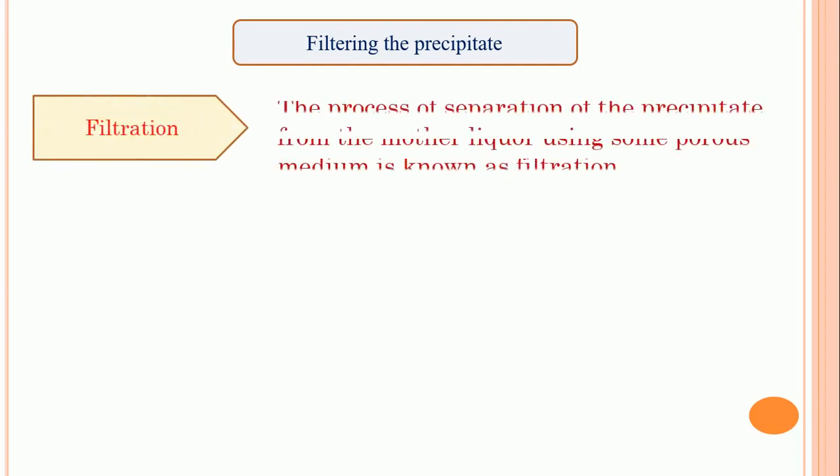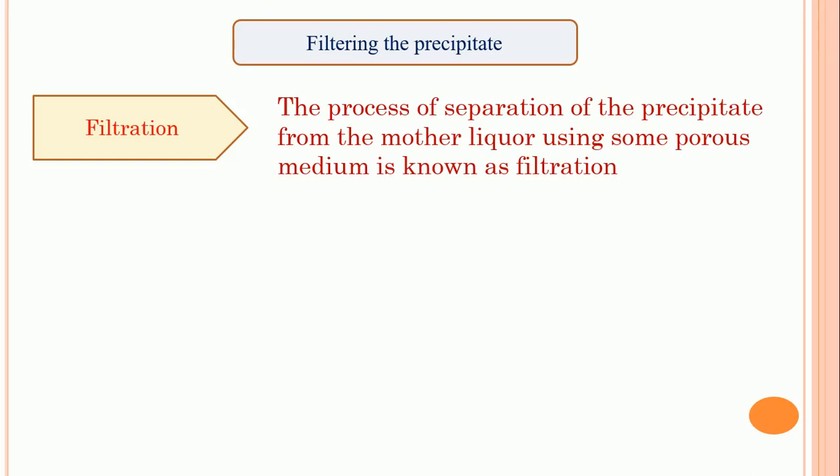Filtration is the process of separation of the precipitate from the mother liquor using some porous medium. Filtration is a very simple technique.